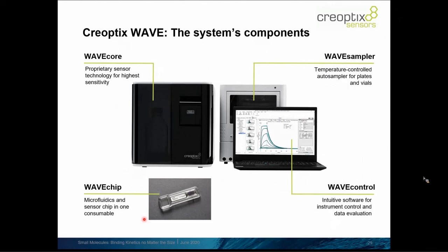That's the full Creoptix WAVE system, and it consists of the WAVE core that houses all the fluidics, all the optical parts, your running buffers, and the port where you insert your disposable chip.